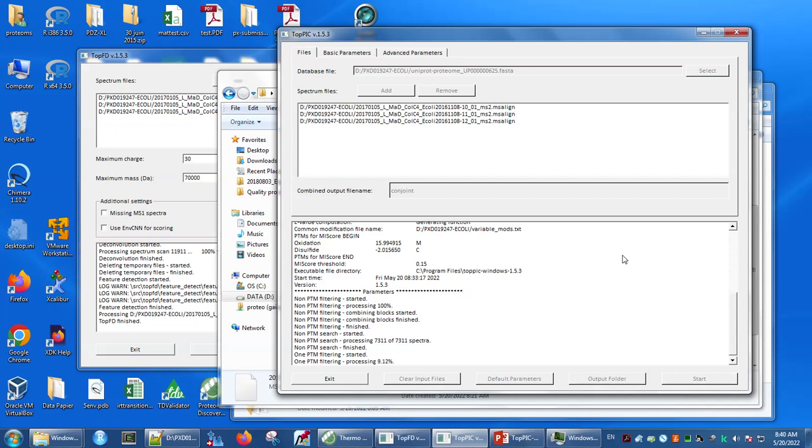Now the software is going to decide which of the results from those 4 possibilities it's going to report for each spectrum, and it computes the expectation values separately for each of those searches, because there are far more possible sequences where you can chop from either end of the sequence than there are if you disallow that kind of chopping. So all 4 of those searches are taking place simultaneously.